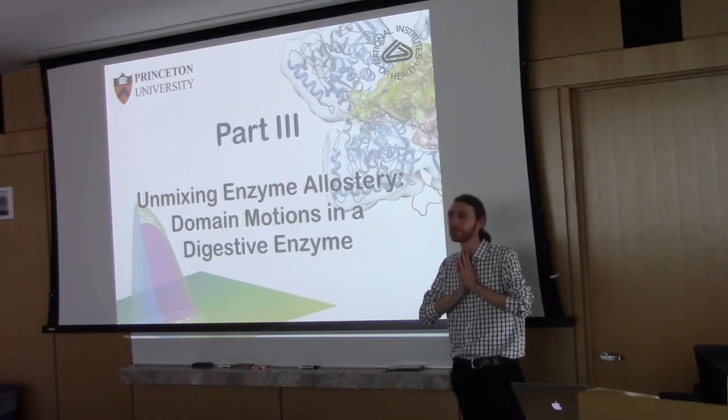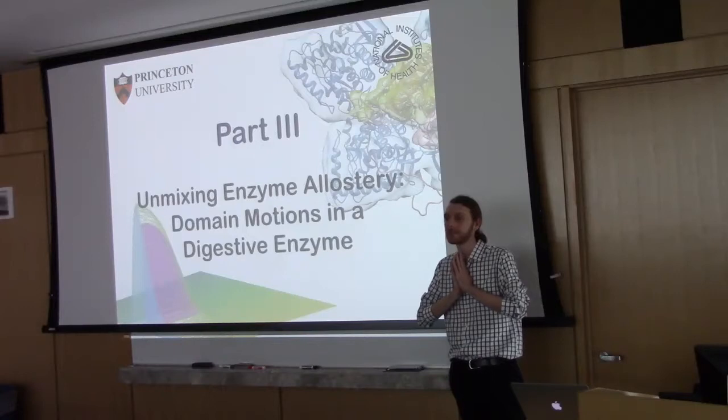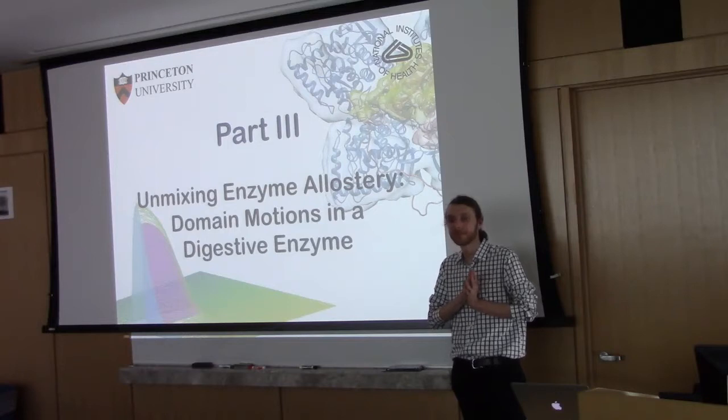Yeah, you can, but you have to keep in mind that even though you have lots of scattering profiles, you could theoretically stay at one end of the elution profile, and then see how it varies across the elution profile, and do this sort of mixture modeling to see if you get these volume fractions. If you start out on your hexamer side of the profile, then go all the way out to your monomer, wouldn't you expect to get a change in the volume fractions in shape moving from one to the other?